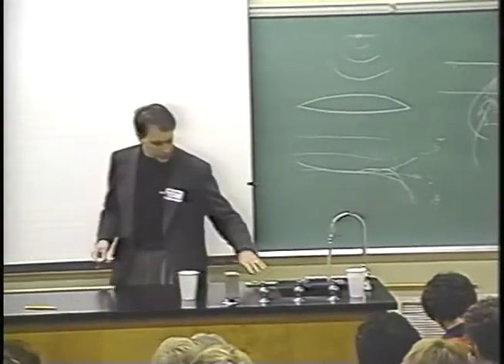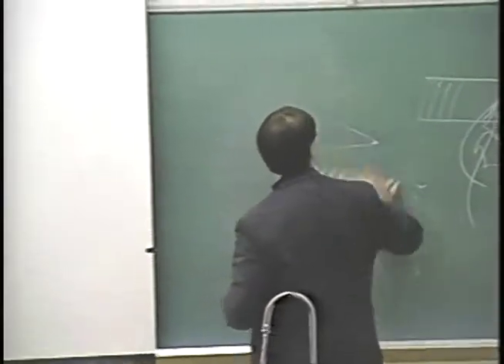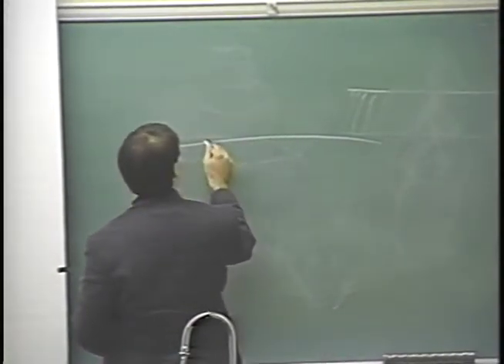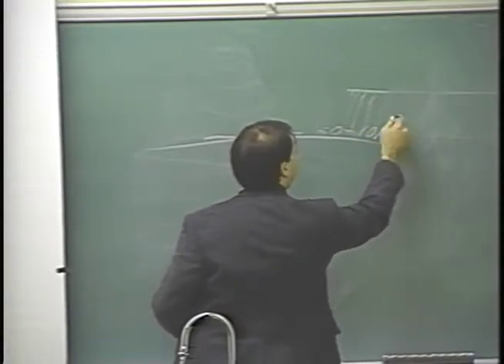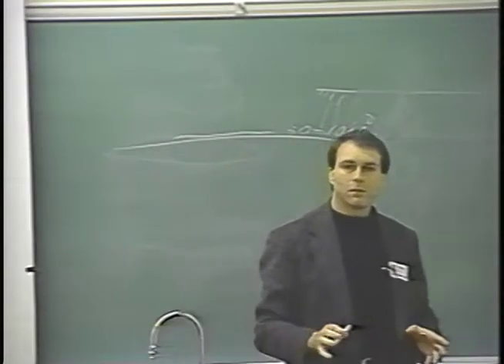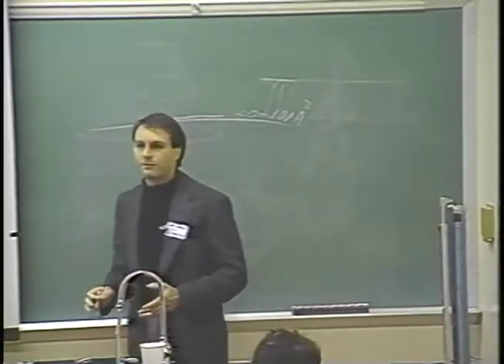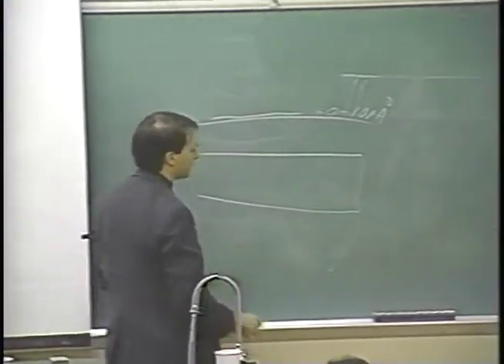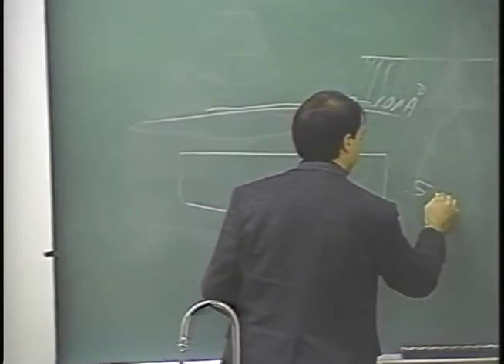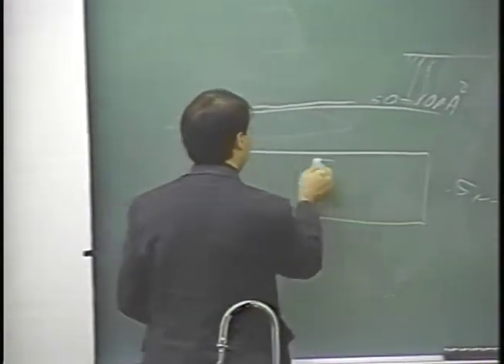So looking at structures that are very thin films in the neighborhood of, say, 50 to 100 angstroms thick. Okay. What I'm going to be talking about is techniques for looking at intermediate levels of structural resolution, for looking at structures that range up to a neighborhood of a half micron thick, and looking for internal structures within the specimen.